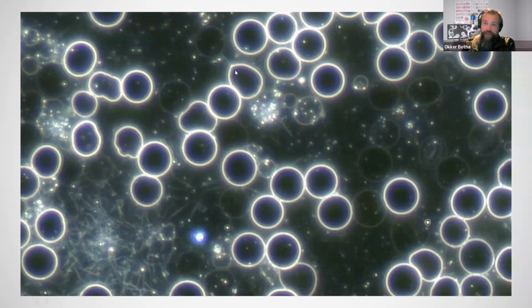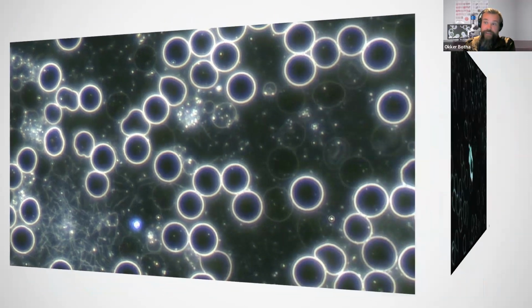You can see fine, thin strands coming off the blood cells, all these things that take place. And I have a few examples of some other things that we see in the blood as the blood starts to break down, as it degenerates. We often find a lot of really interesting structures that emerge, and that are quite significant and important to be able to see, but they are really thin and quite faint.